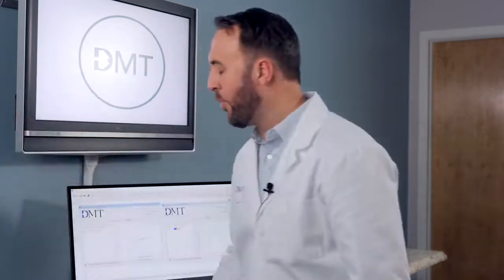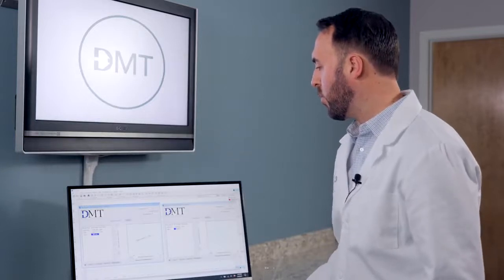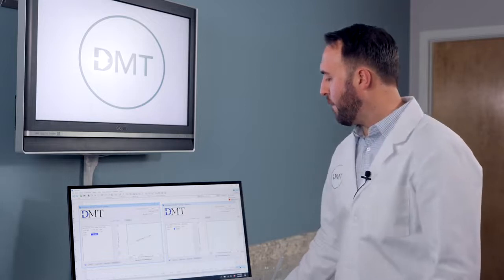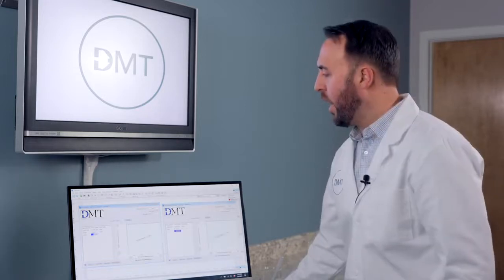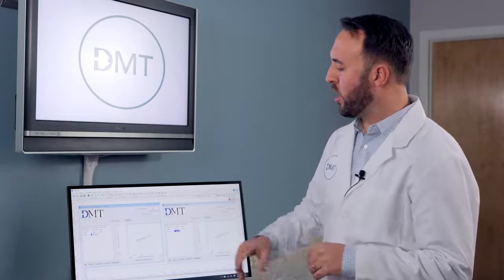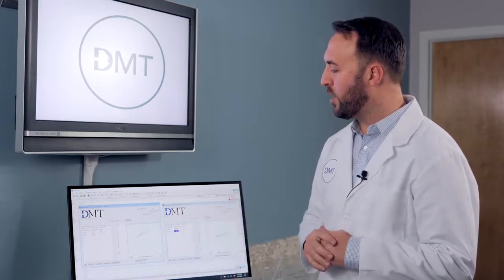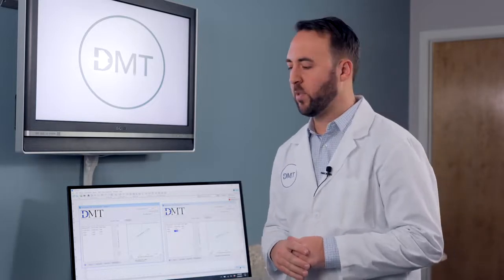So I'm just going to add 30 microns and let this go. And then I will do the same thing for channel 2. And after that, you will begin to see the line with the best fit curve. What we are trying to do is just get over this target pressure line, which means that we have reached the target pressure point, which will give us our maximal responses.